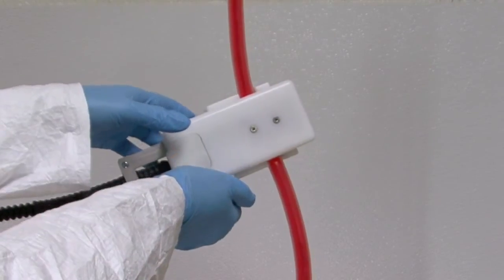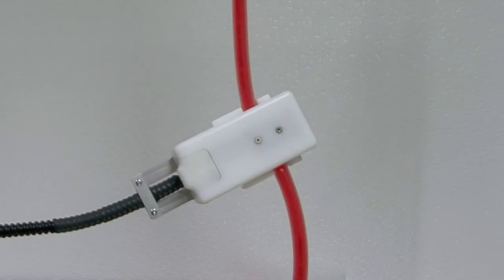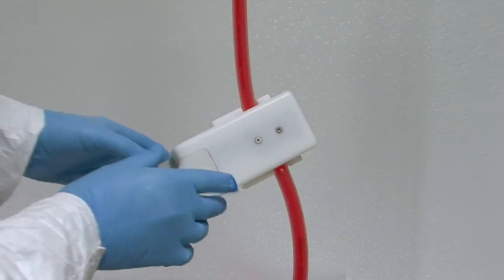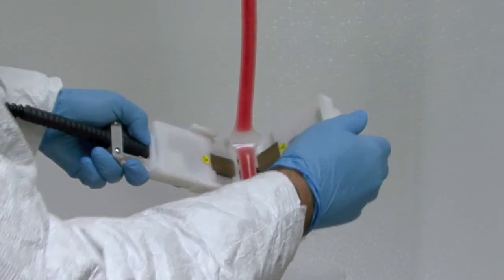A technician can bring the sealing device to the tubing, insert it, and perform the sealing process. The sealer uses heat and pressure to reform the tubing into a leak-proof termination point. The entire process is complete in less than two minutes.